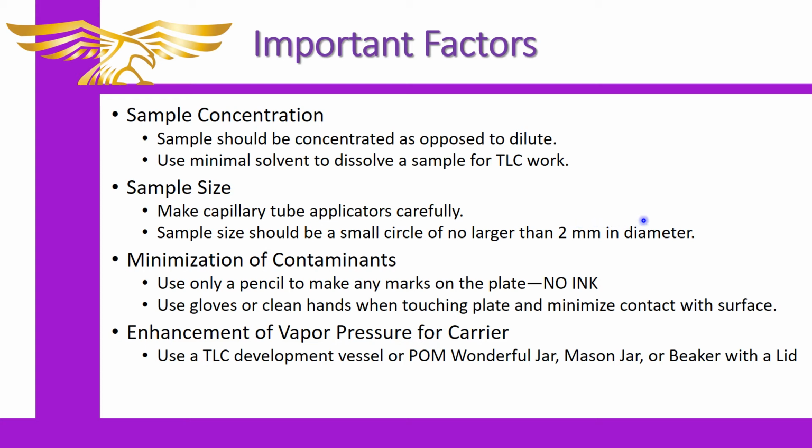And it can even be 1 millimeter in diameter, and that is considered sufficient. I will say that that rule is probably the hardest for people to meet, especially the first time that they're doing the experiment, because most of you have never spotted a plate before, and I have not even done it in some time. I might not get this right every single time.